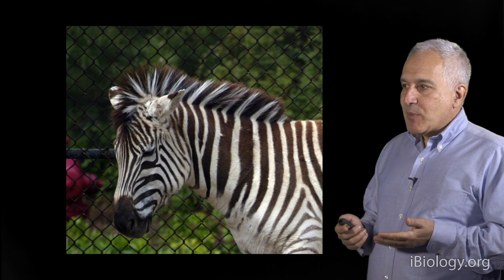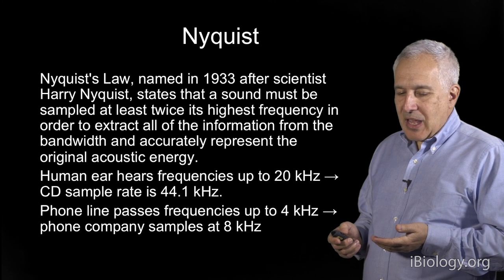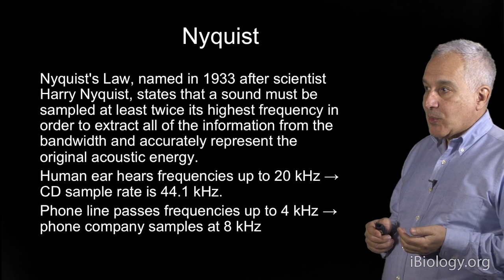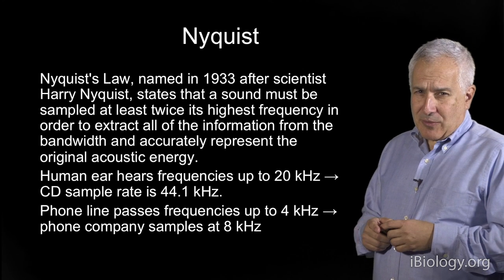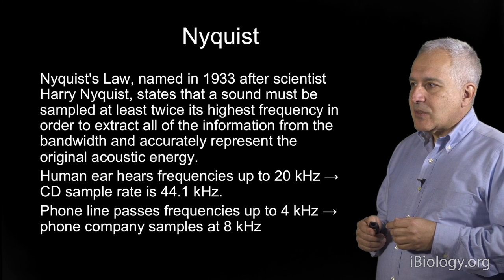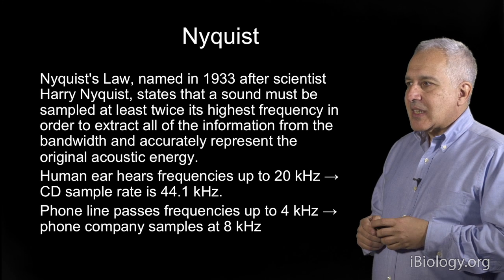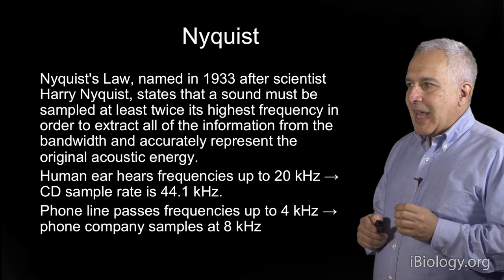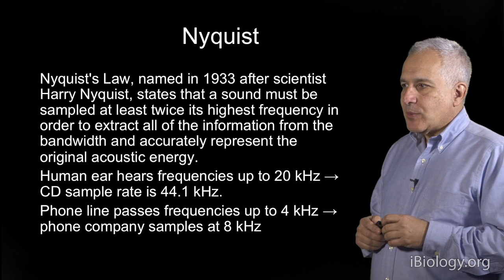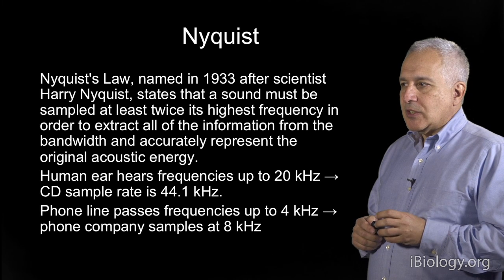So how do you know how much resolution you need? The person who has helped us best with this is a guy named Harry Nyquist. And some of you may have heard of the Nyquist Limit. It's a law that was named after him in 1933. He was a scientist interested in sound, and he stated that sound must be sampled at least twice the highest frequency in order to extract all the information from the bandwidth and accurately represent the original acoustic energy.